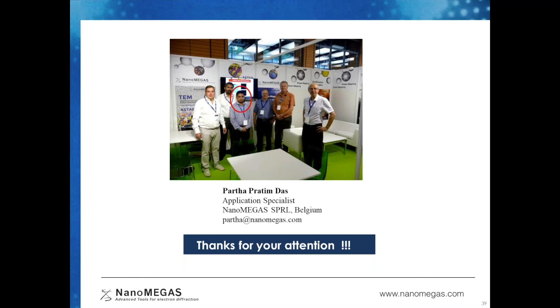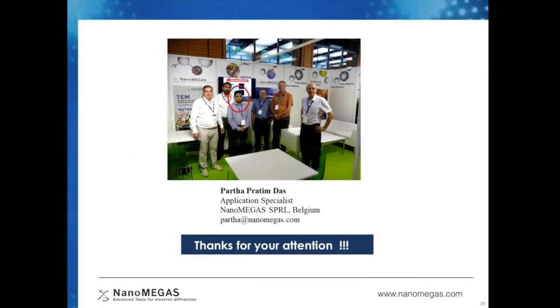Personally, for me, it has been a very challenging and rewarding journey to study different types of materials using electron diffraction techniques, and to develop new methods for structural characterization. I'm sure you will try electron diffraction, 3D electron diffraction, or pair distribution functions after this presentation.